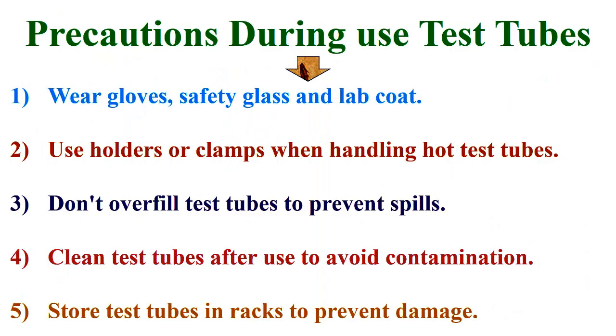During use, wear gloves, safety glasses, and a lab coat, and use holders or clamps when handling hot test tubes. Don't overfill test tubes to prevent spills, clean them after use to avoid contamination, and store them in racks to prevent damage, as mentioned in the next slide.